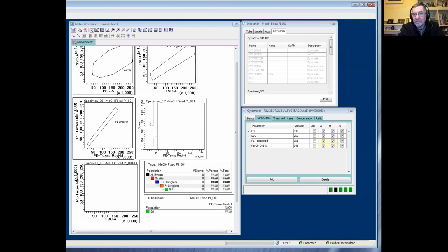If you're treating your cells with something that maybe blocks them in early S or middle of S, you want to know where the G1 peak is. So keeping your cell concentration consistent will help you with that.